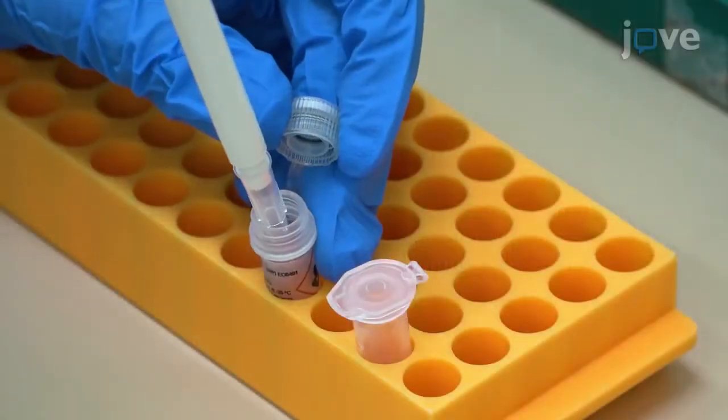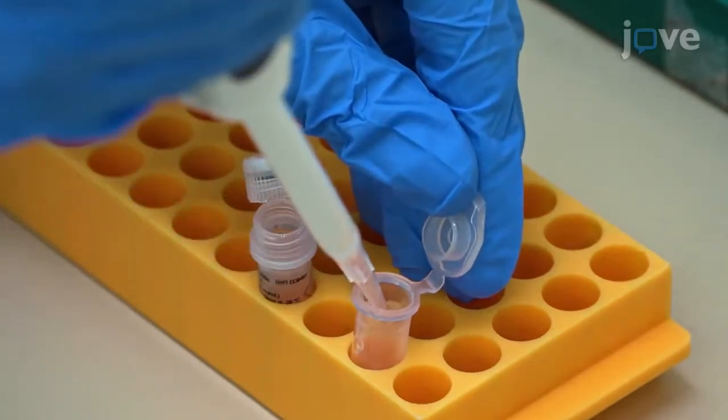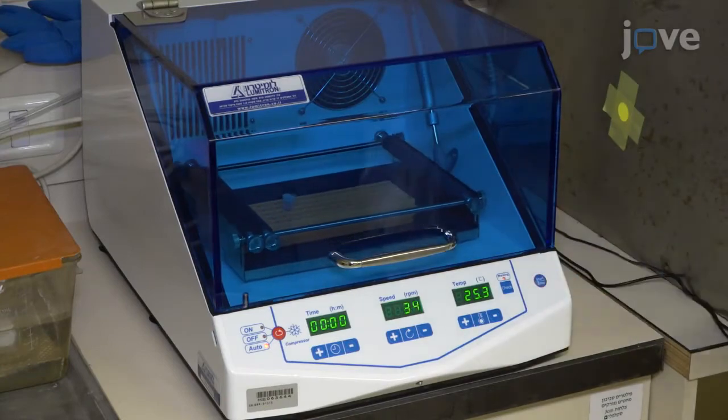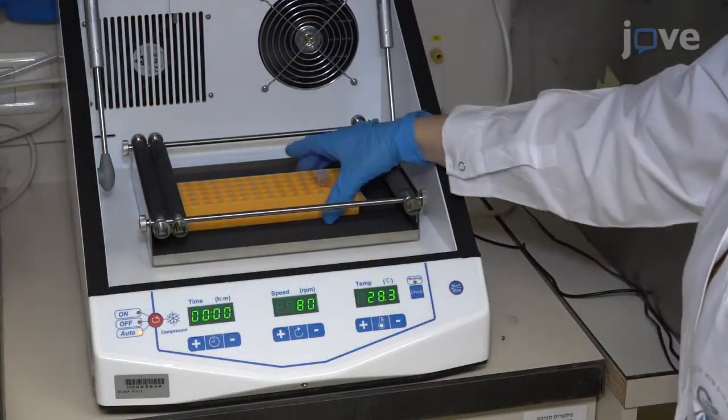Add 17.5 microliters of 20 milligrams per milliliter proteinase K and incubate the tube overnight at 55 degrees Celsius with gentle shaking. After the incubation, allow the sample to cool to room temperature for 5 minutes.